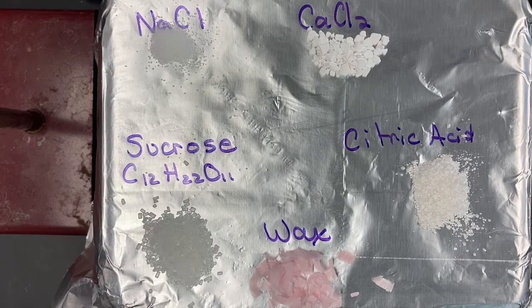So, on your hot plate here, you will see 5 different substances. In your lab, they are calcium chloride, citric acid, paraffin wax, sodium chloride, and sucrose.